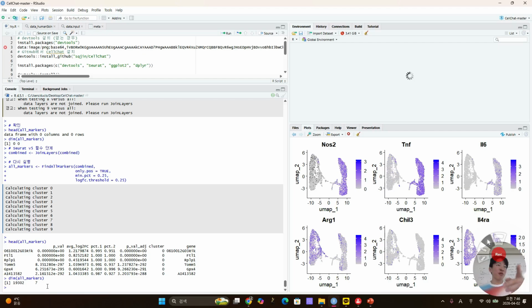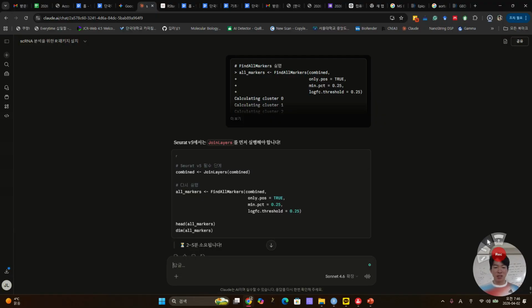So yeah, this is a very good question. When you finish analyzing, or are almost done, and you want to exit, if you save all of the content it is a few gigabytes, very big. So in that case, I want to stop here, but what is the essential thing to save? Let me know based on the code.